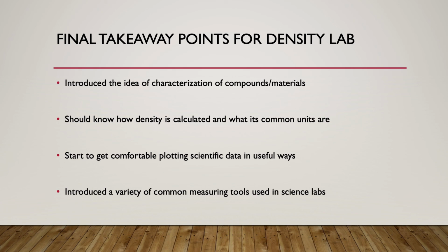And the last thing here, just getting introduced to some common measuring tools from the lab. You saw we use vernier calipers, which we won't use too much throughout the semester, but graduated cylinders for measuring volume and balances for measuring mass, we're going to be using almost every week. A lot of the labs we do involve solutions that we need volumes for, so using graduated cylinders is going to be very common. And one of the things we want to keep in mind, as we saw earlier, is the number of decimal places to give for those volumes. That's something we always want to have in mind as we make those measurements throughout the semester.